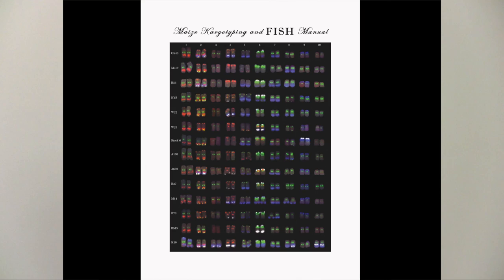Given the time constraints, it's assumed that the viewer has experience with standard molecular biology techniques, has knowledge of basic laboratory safety, and is aware of hazardous material disposal regulations. Recipes and additional detail can be found in two companion resources, the Karyotyping and FISH Manual, and the Maize Somatic Chromosome Painting article in PNAS.